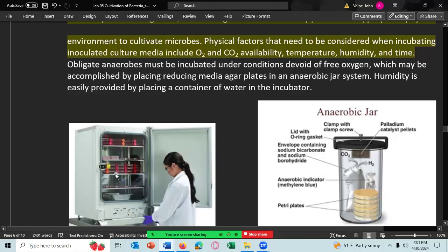So you may only get 3 days of growth on the plate instead of, I don't know, something like 2 weeks of growth on the plate. Obviously, the incubator can control the temperature. And those are the three things that we can control in our simple incubators.